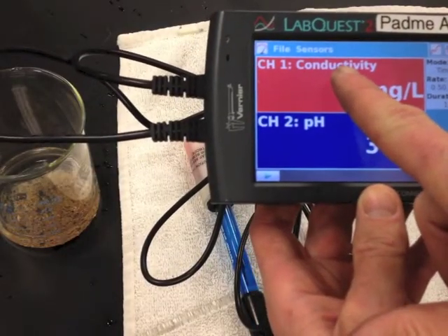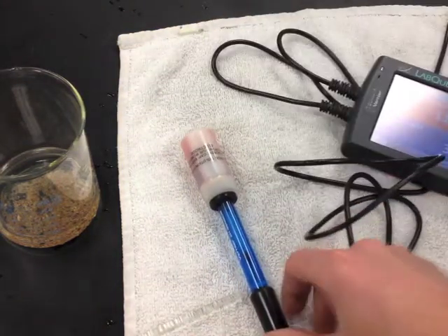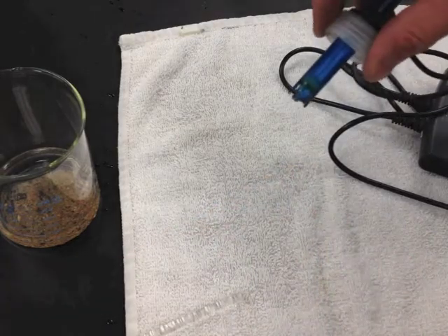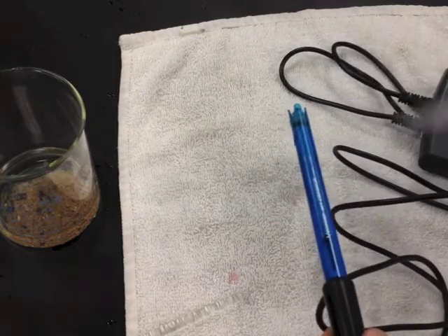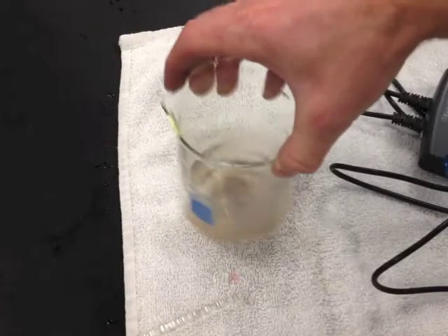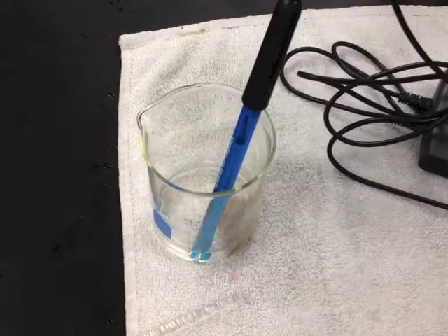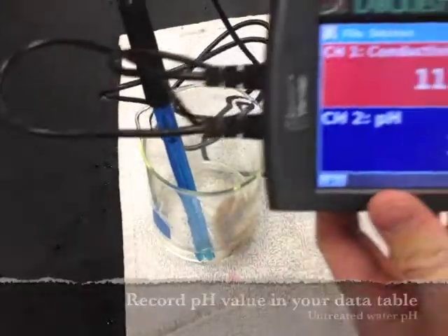You can leave the conductivity probe plugged in, but now let's go ahead and use the pH probe — go ahead and plug it in. Take the storage solution off, remove the cap, and rinse the pH meter. Make sure that your solution has been mixed — this is the untreated water — and then take a live reading of the pH. Be very careful not to damage the pH probe because it's very breakable. Record your pH in the data table.